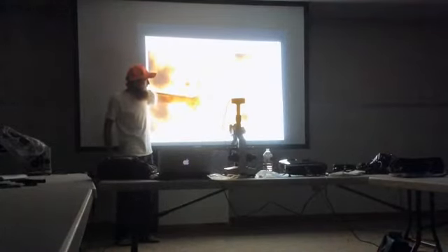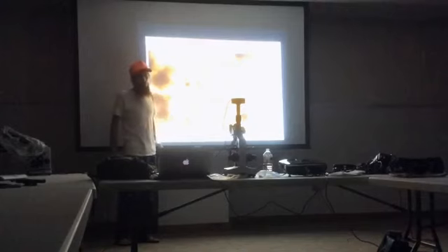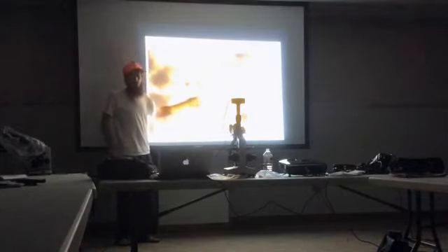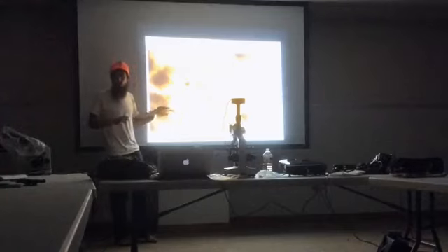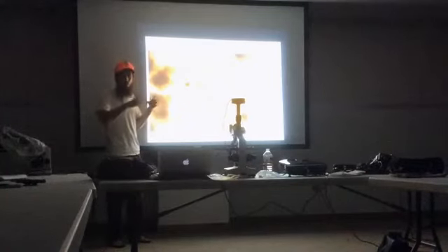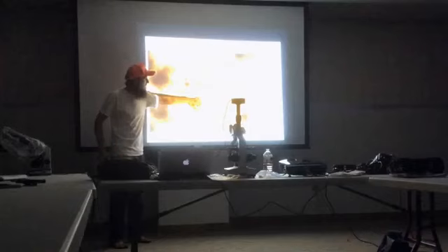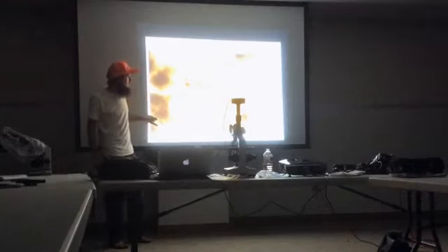Then there's this here, which is either an algae or a piece of pollen. Both algae and little diatom type of things look really fractal, and so do pieces of pollen that you'll see. So chunks of things like that in there are pollen or an algae, depending.